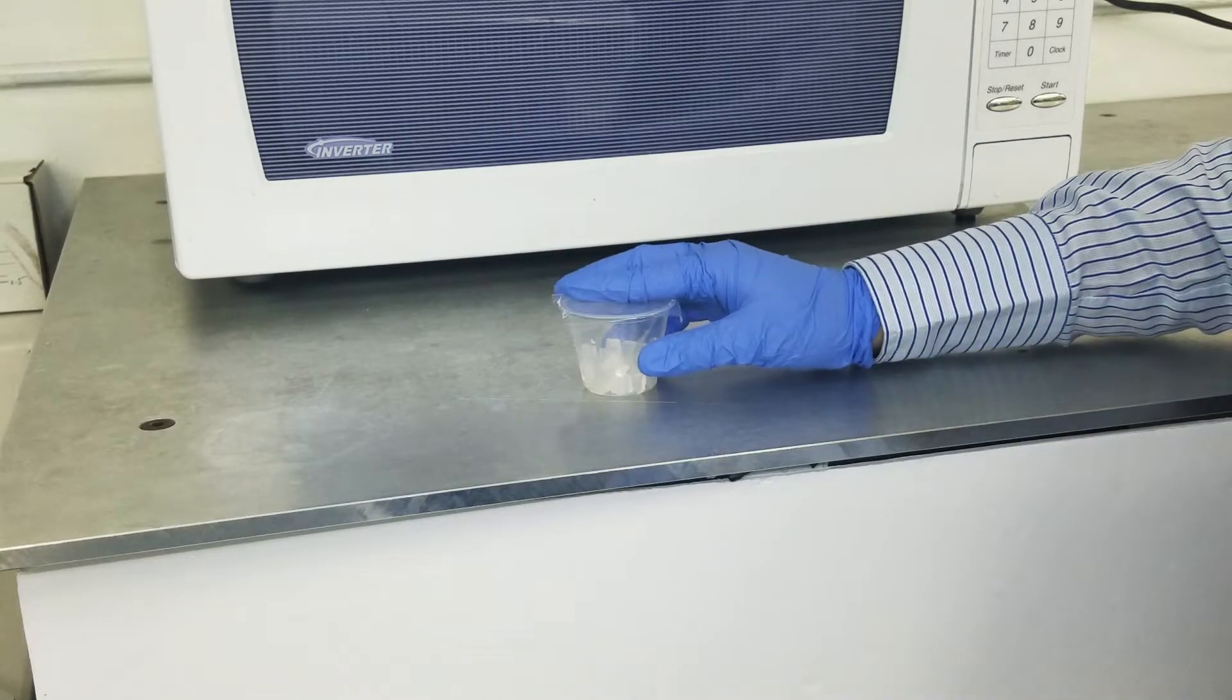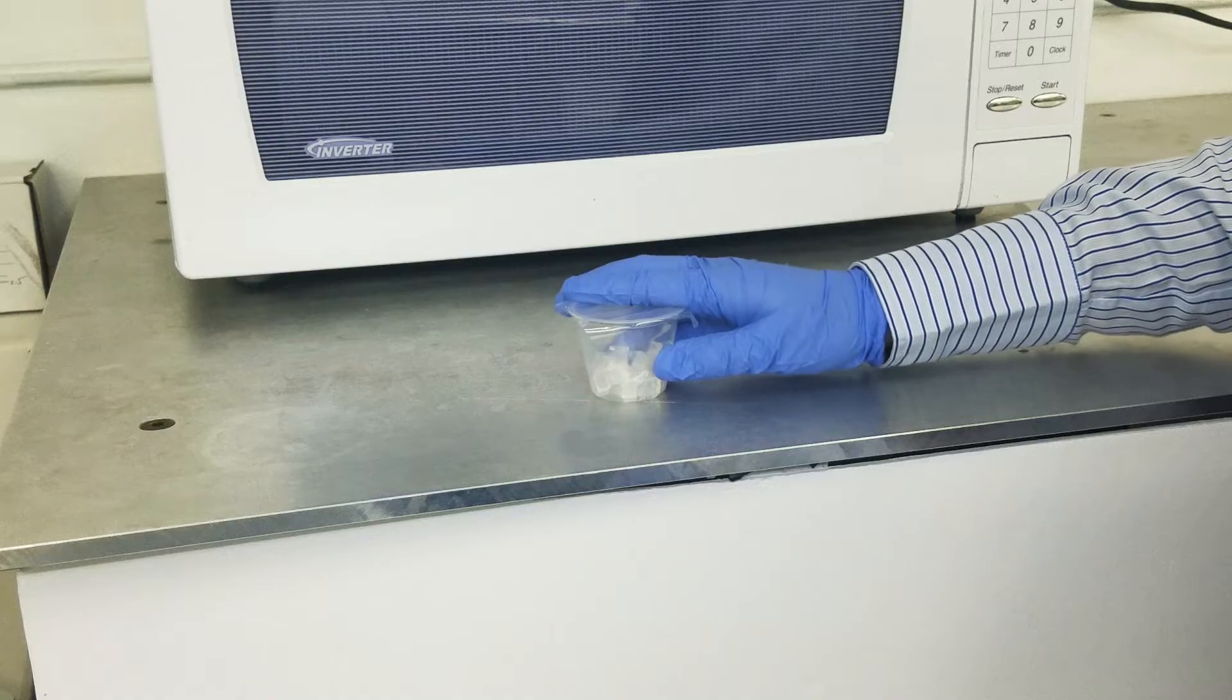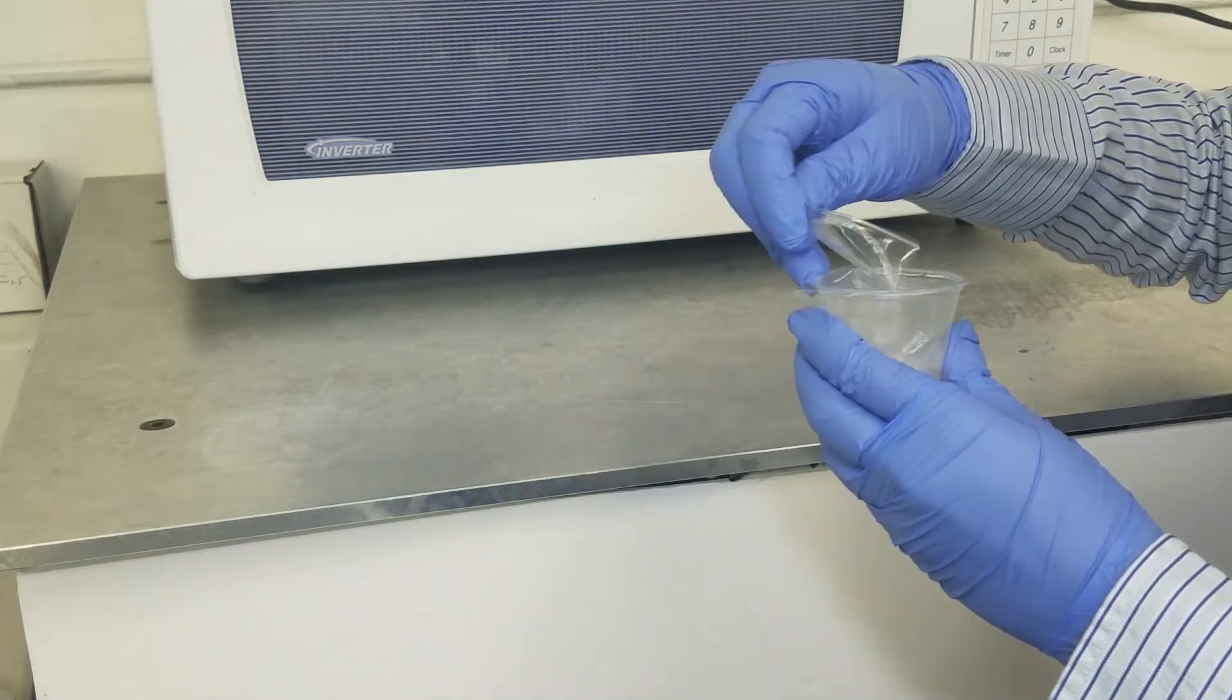Take your gel cup and tap or knock all the agarose chunks to the bottom. Partially peel back the lid. It is important not to leave the cup sealed as sealed cups can explode in the microwave.